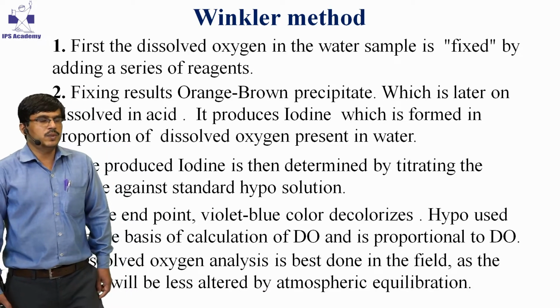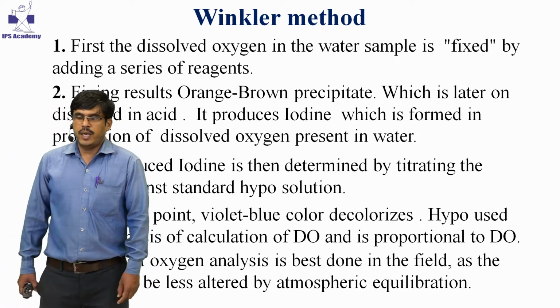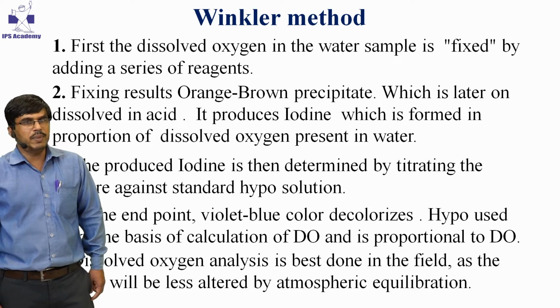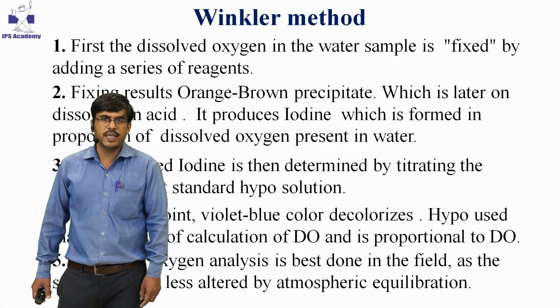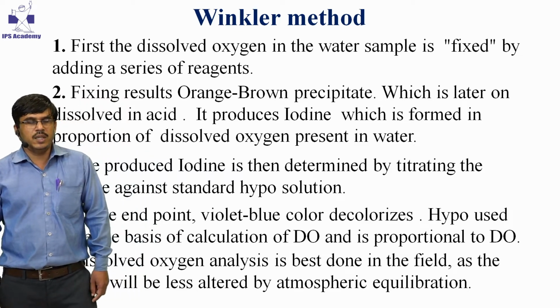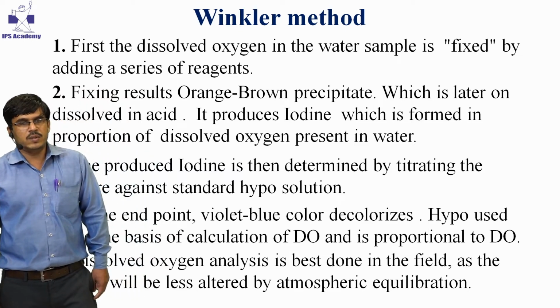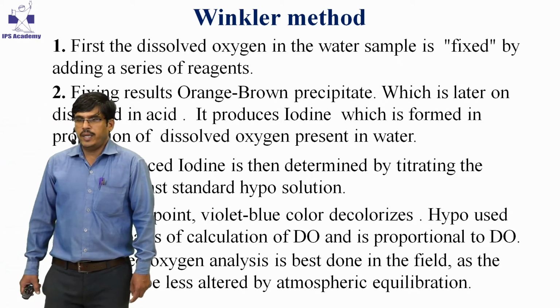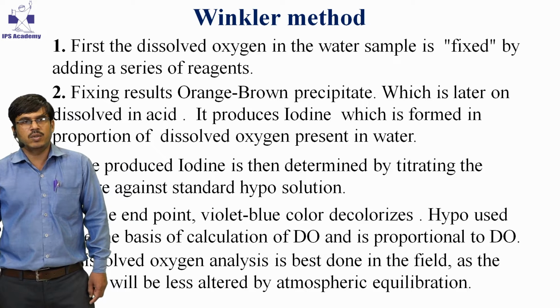Therefore, it is ideal that we determine the dissolved oxygen at the sampling site, or otherwise we can fix the oxygen with reagent and then bring the sample to our lab to determine the dissolved oxygen.